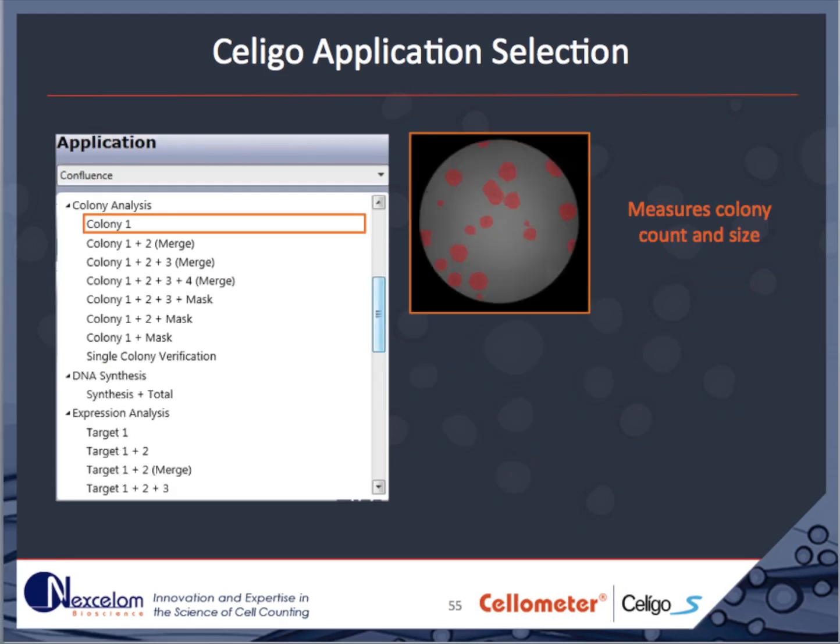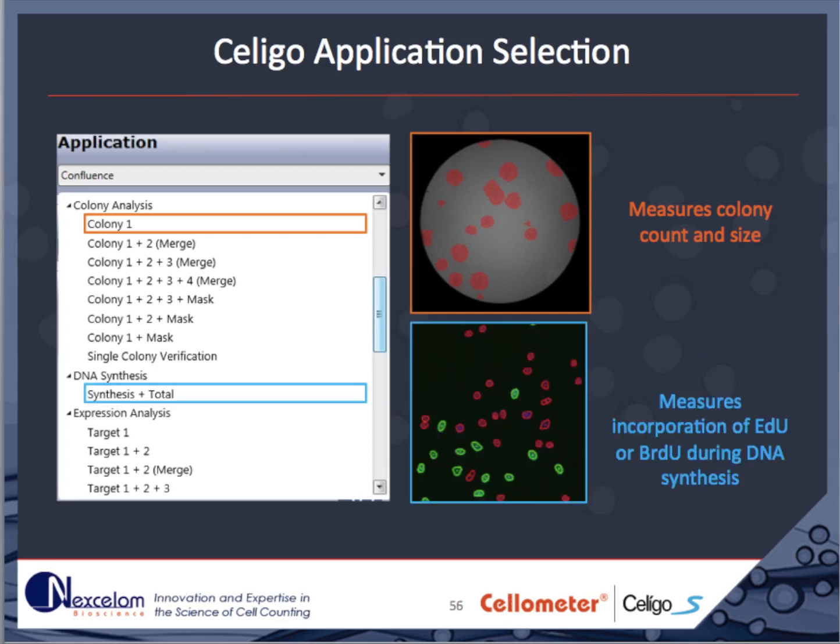The colony application uses the texture algorithm to identify and report the number of cell colonies detected. It can also be used with fluorescence and to detect plaques in viral assays. The DNA synthesis assay is a two-channel assay that can be used when assaying cell cycle with either EDU or BRDU to highlight cells in the synthesis phase. Segmentation of cells into each cell cycle phase is performed in the gating tab.